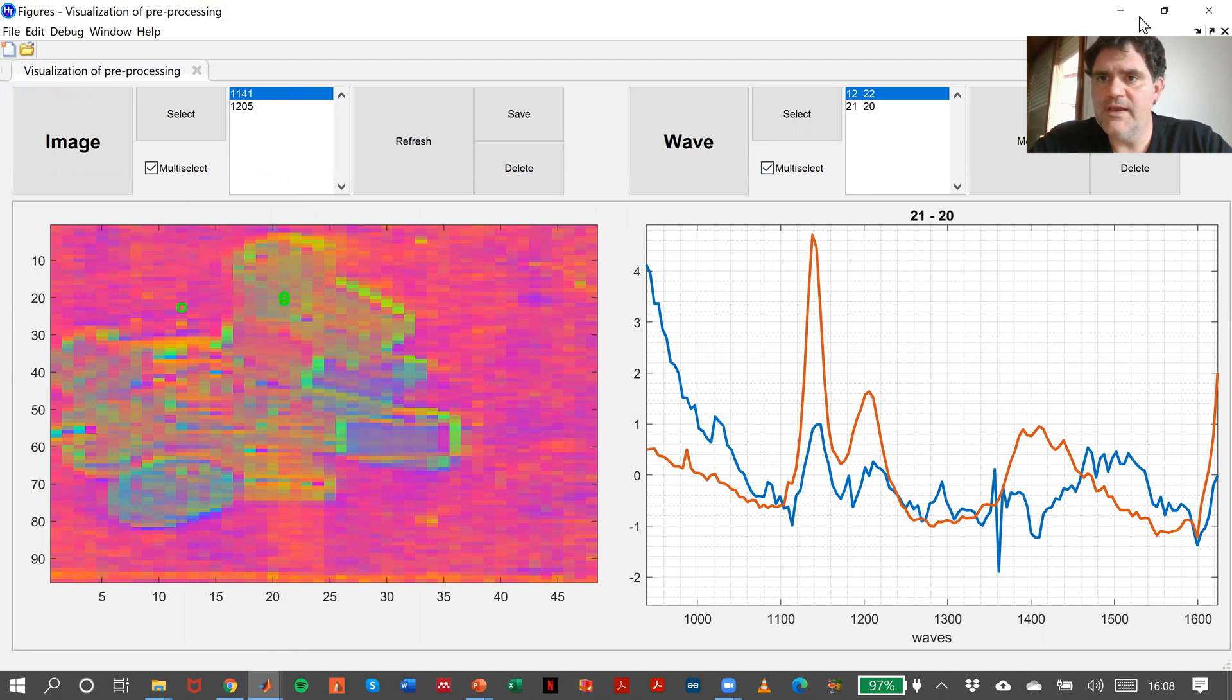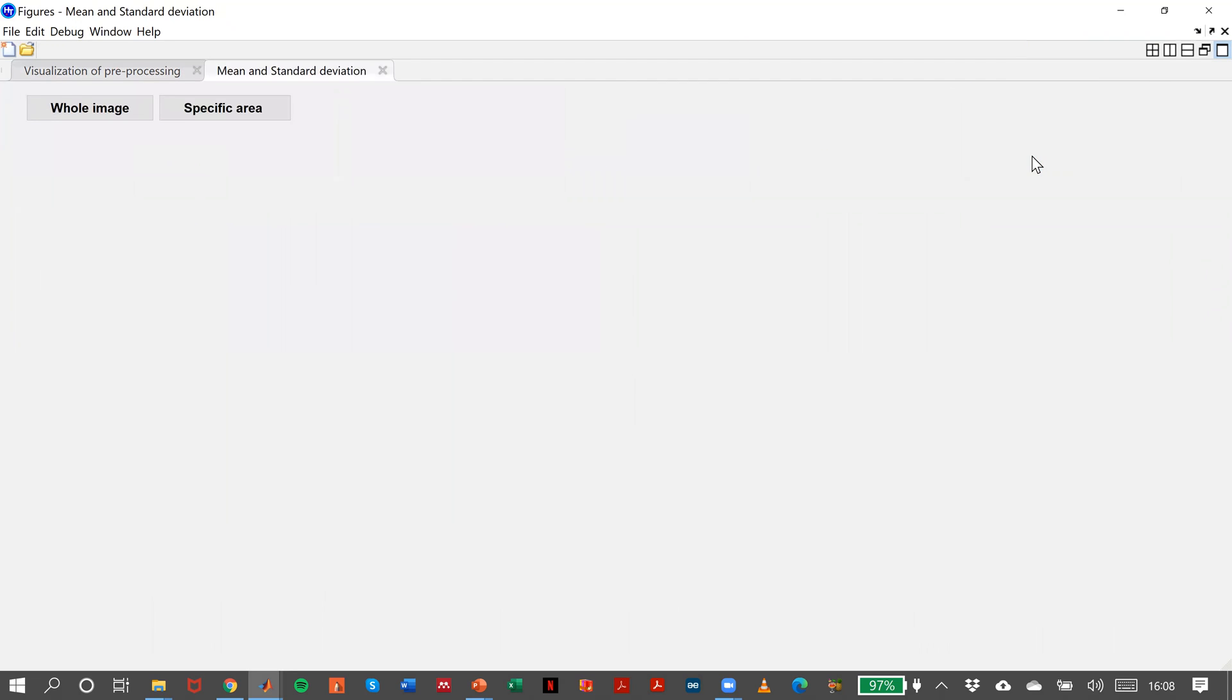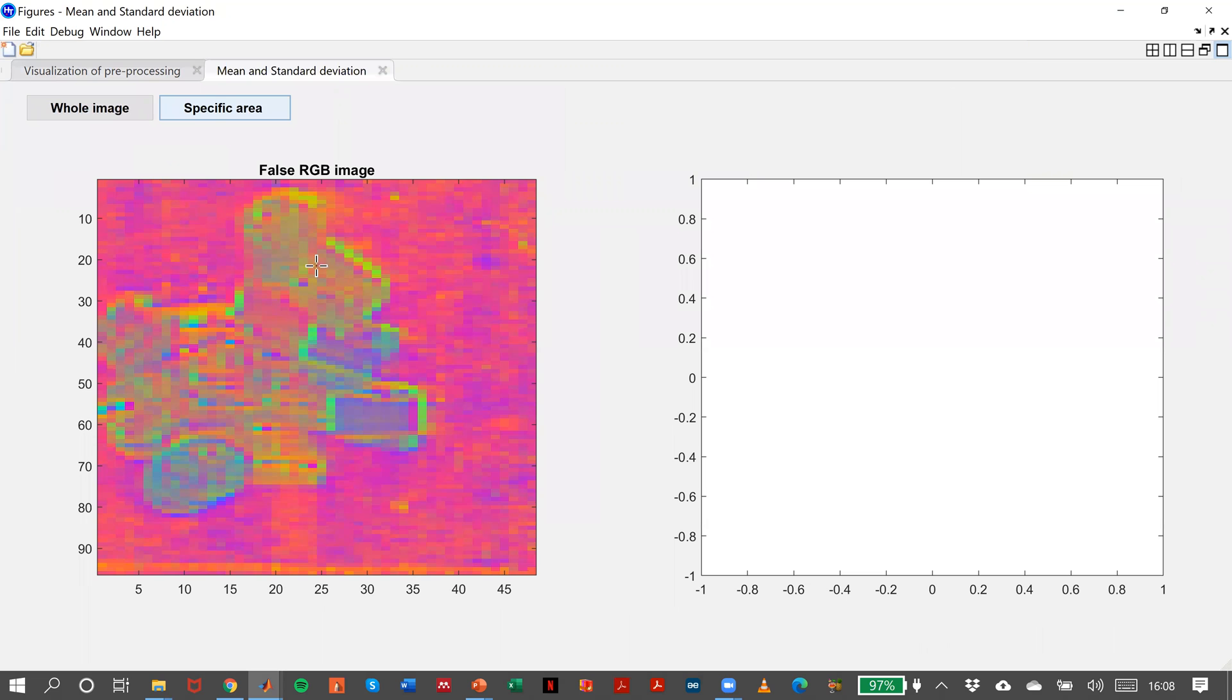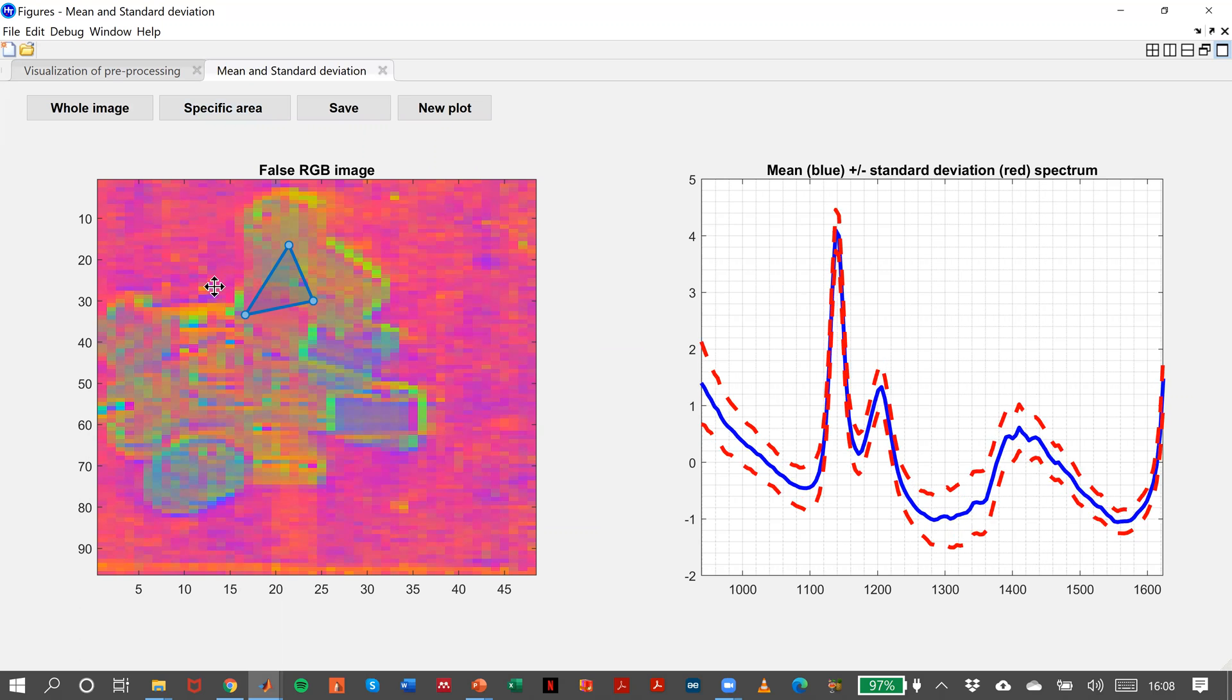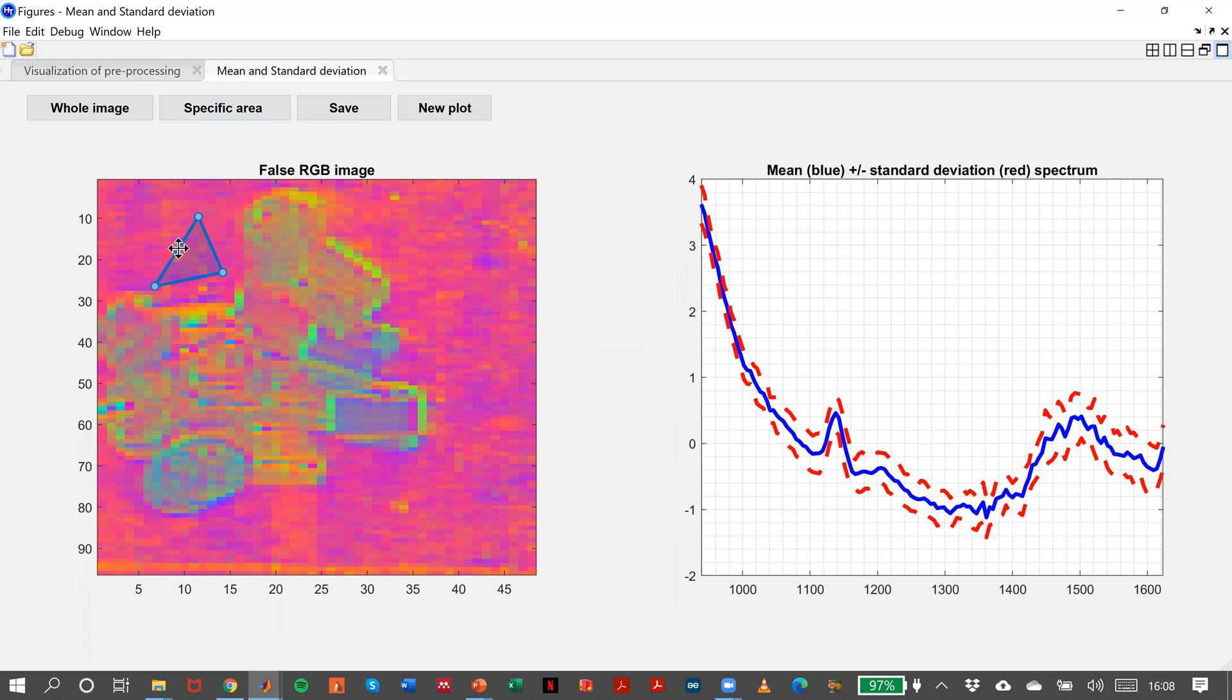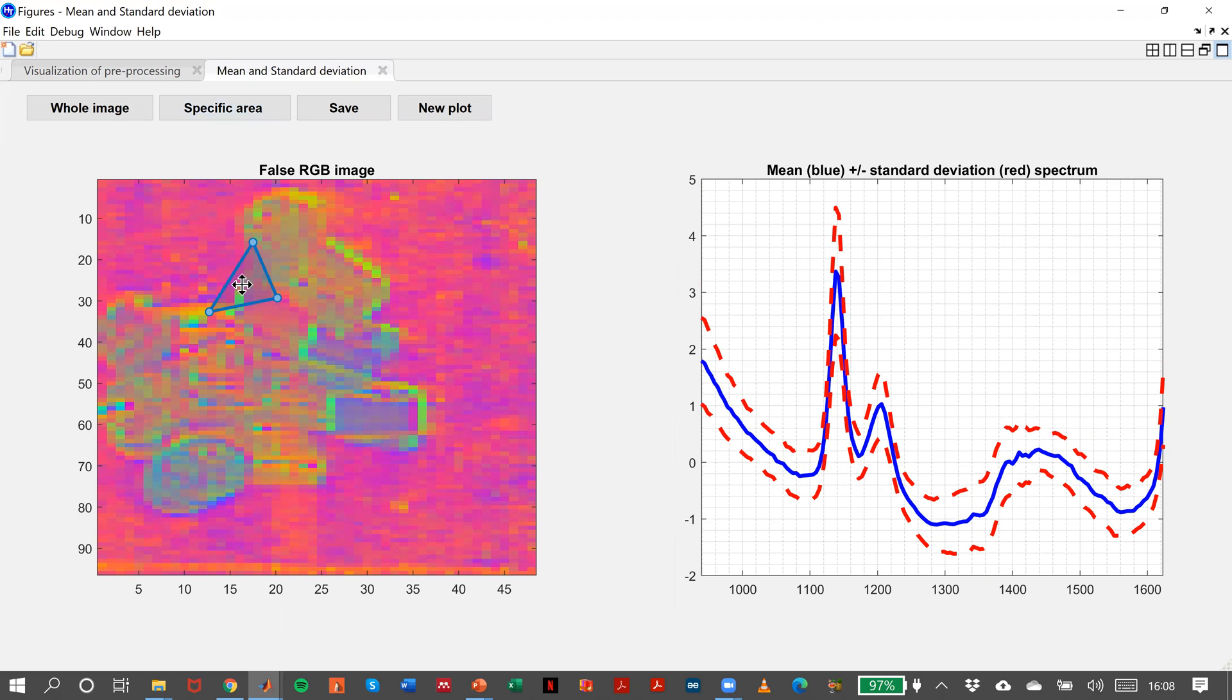Or even we can calculate in some specific areas the average spectrum. And we can move and we can save all this information as we did before.